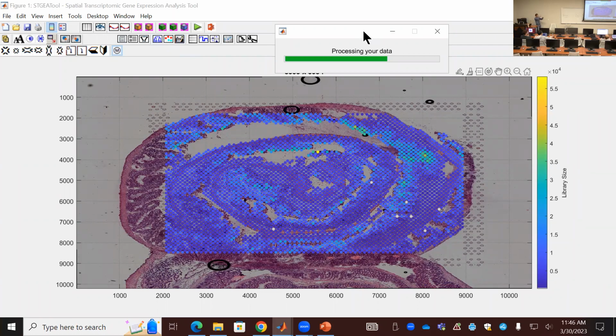This structure has a circle in there, so I hope some of these clusters will be around the circle region rather than just by distance. So we are not using any of this distance in our clustering algorithm. So the algorithm will treat every spot as an individual cell.